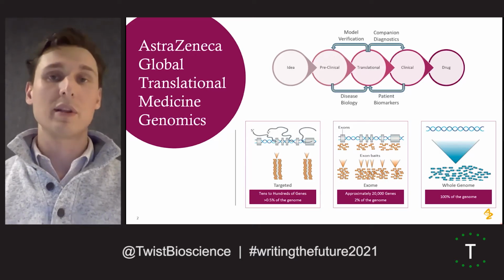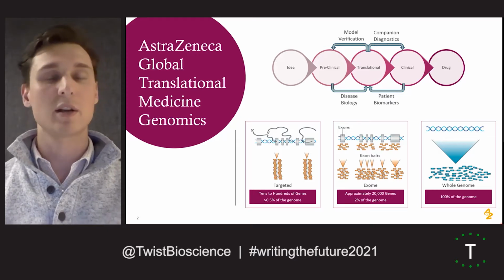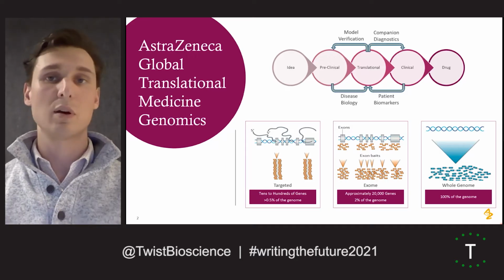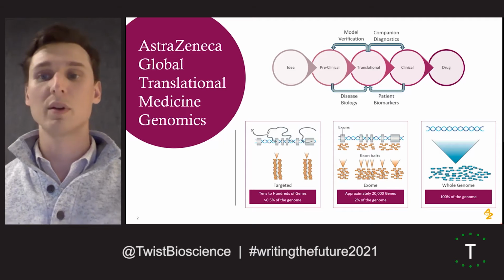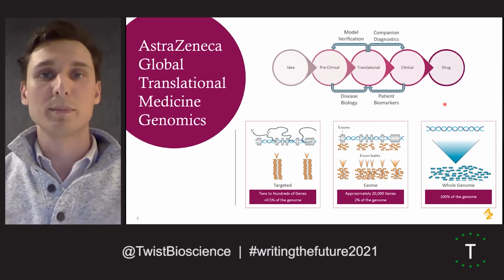We are primarily a sequencing facility, and we perform DNA-seq and RNA-seq. Today I'm going to be talking about a large DNA-seq panel. We perform a wide variety of DNA sequencing. We perform targeted and exome and whole genome sequencing at quite a clip.